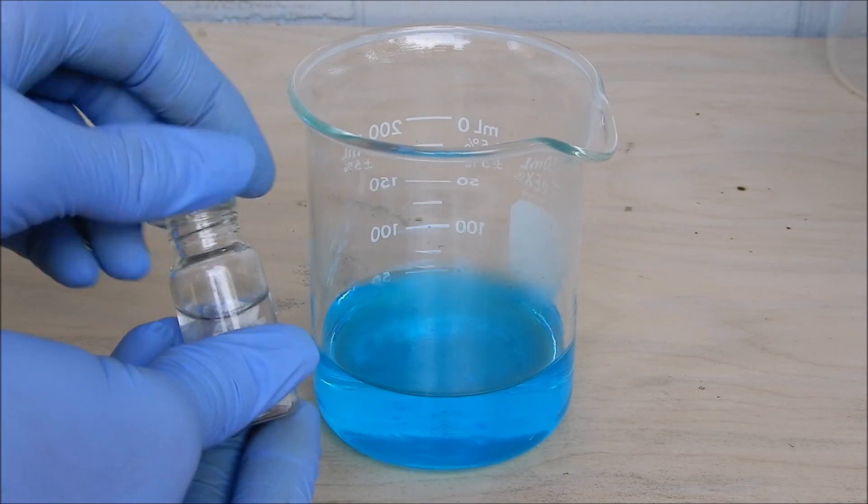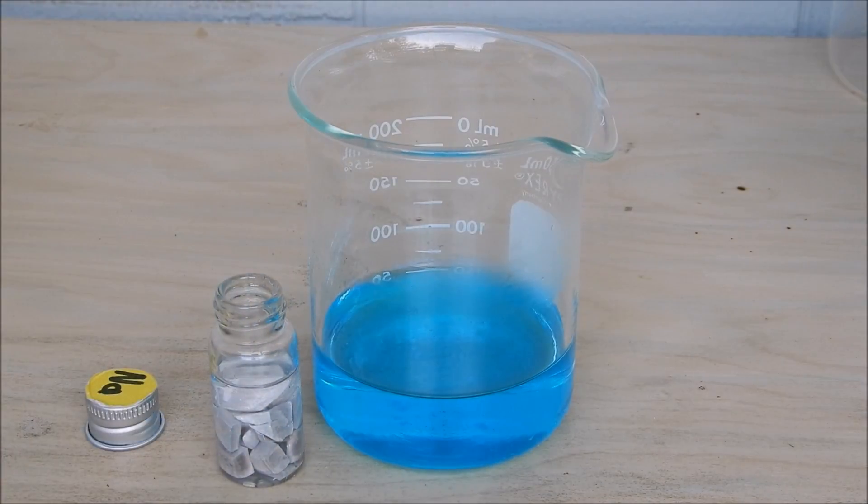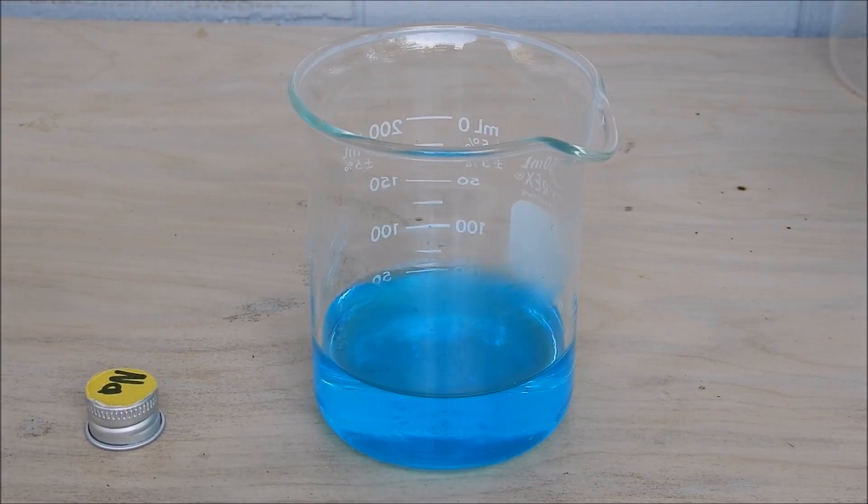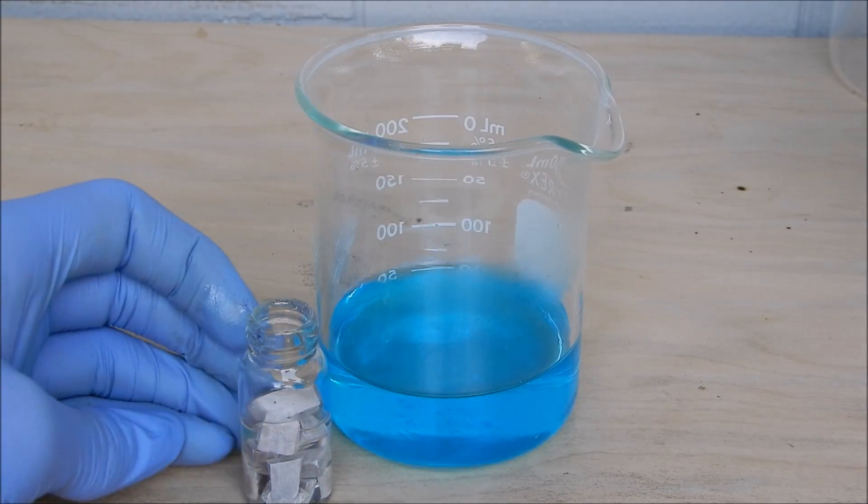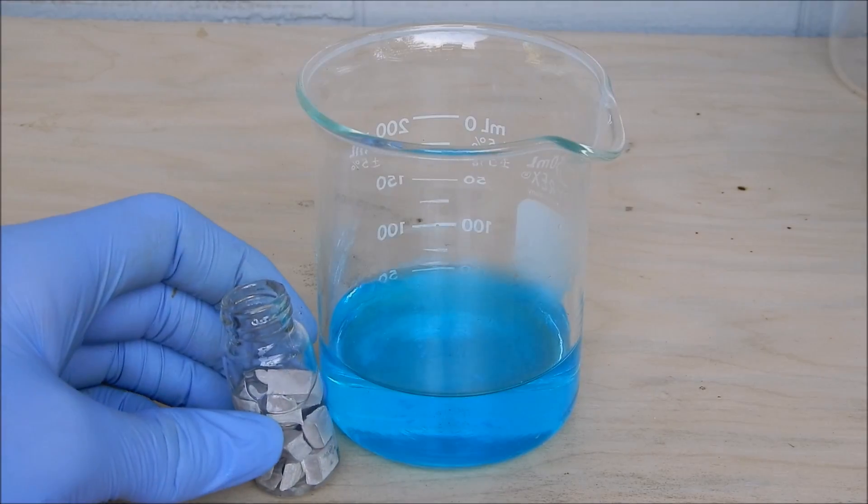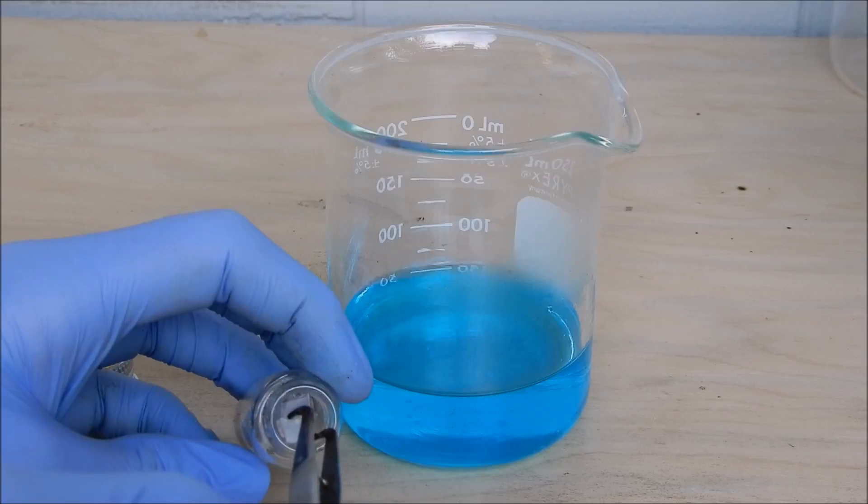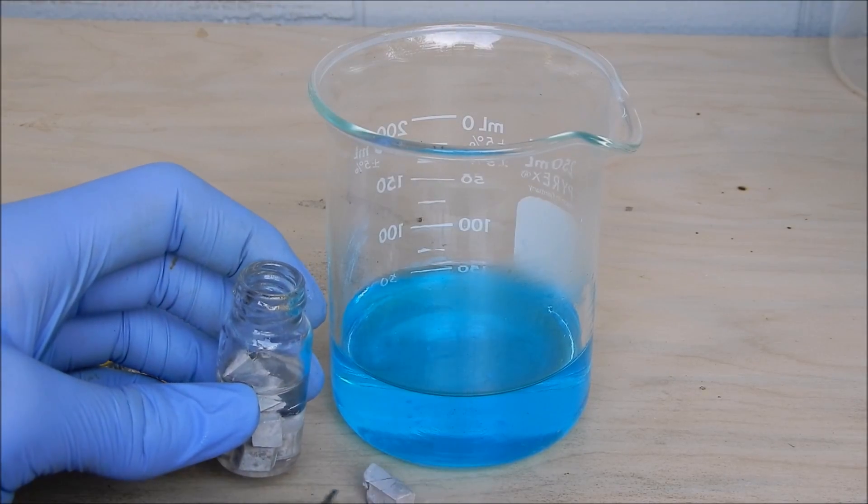What's going to happen is that the sodium metal is going to be oxidized because it loses its valence electron, and the copper two ion in the copper sulfate is going to be reduced to copper metal. Let's take a piece of sodium out. Let's cut this one in half because I don't want to waste my precious sodium.